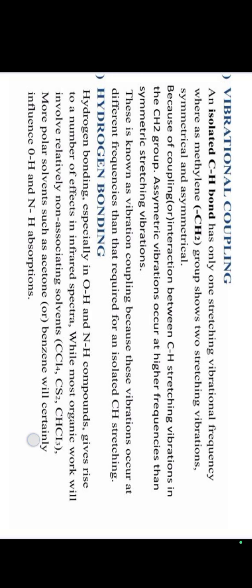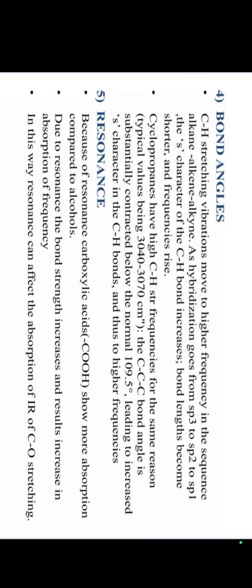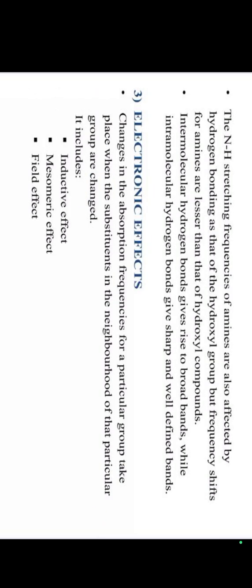Third one, electronic effects. Changes in the absorption frequencies for a particular group take place when the substituents in the neighborhood of that particular group are changed. It includes inductive effect, mesomeric effect and field effect. This also affects the vibrational frequencies. Fourth one, bond angle.